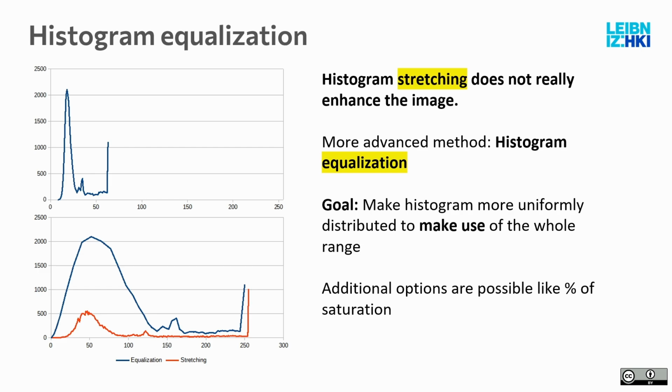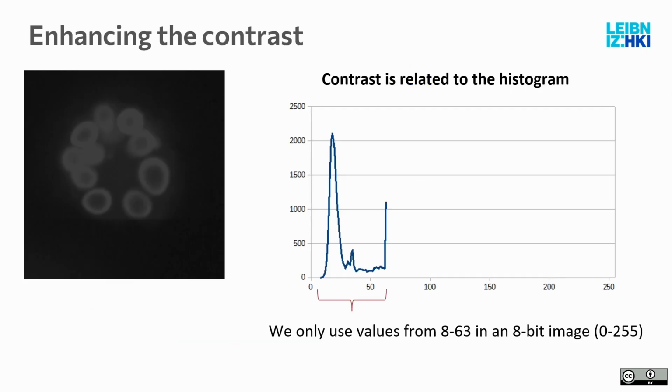The idea of histogram stretching and histogram equalization is to make use of the whole range that you have available, so later on the algorithms respond better and you can see it better too. You imagine you have something so low contrast, you can stretch or equalize it so you can actually work with it properly. We have some example data where you absolutely need these, especially 16-bit images, which go to 65,000 something, but our structures are at like 1000, and you don't see anything anymore.